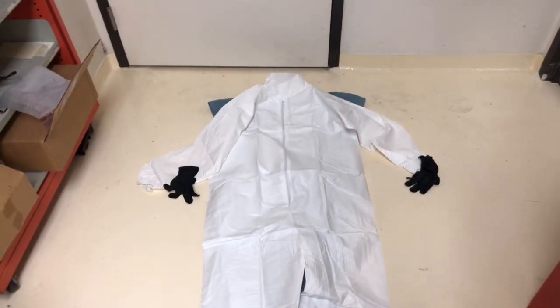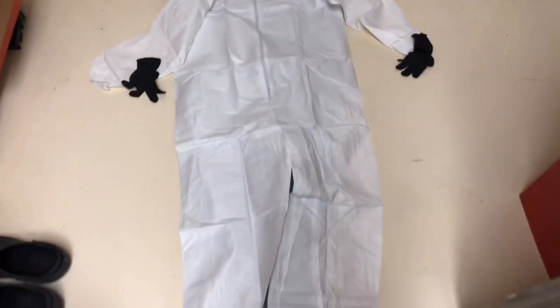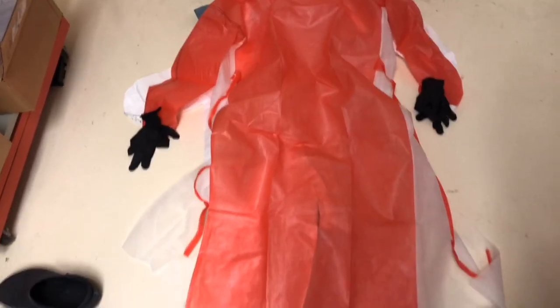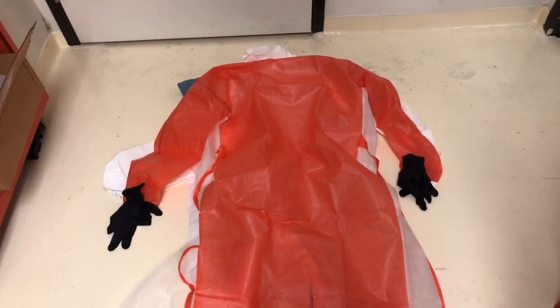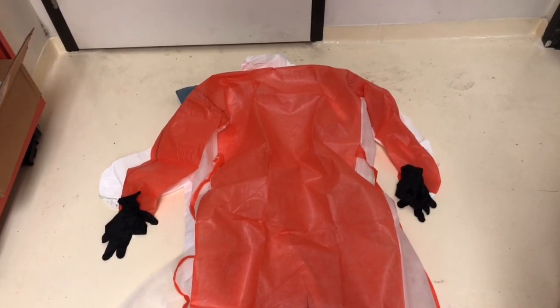We then have our first true layer of protection, which is a pair of gloves, the white Tyvek suit, the white onesie, and some shoe covers to give us that outer layer, or our first outer layer of protection. The final clothing layer of protection comes in the form of a big old apron and an extra pair of gloves. So at this stage, there are scrubs, a Tyvek suit, an outer apron, shoe covers, and 2 pairs of gloves, all protecting us from the room we are working in when working with coronaviruses.